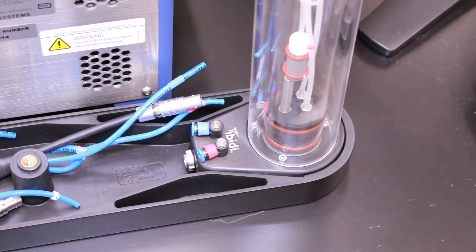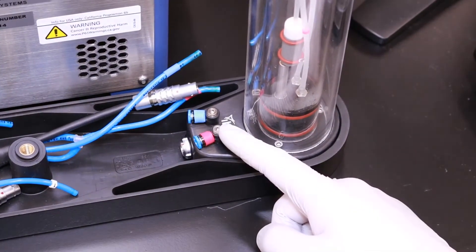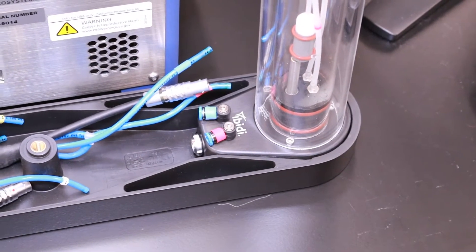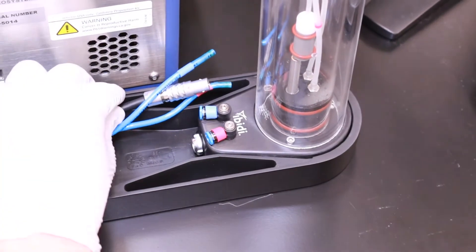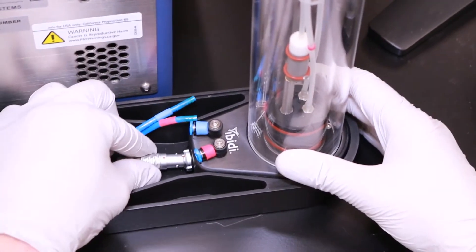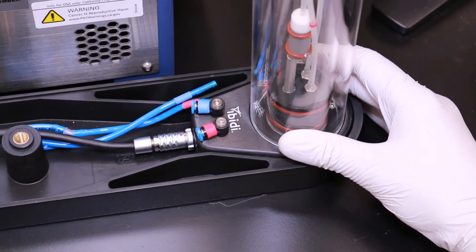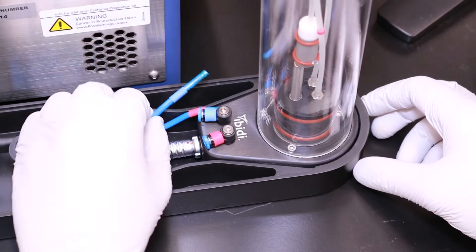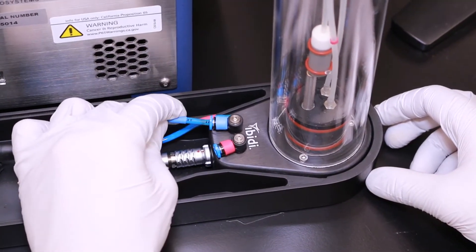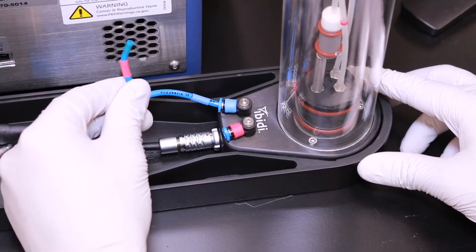Now with the environmental control tray open, we can see that the tubing as well as the ports on the humidifying column and on the side of the instrument are all color-coded to ensure the simple installation of your environmental control hardware. First, we'll take the electronics cable and align the red dot with the red dot on the port on the humidifying column, then slide the cable in. Next, we'll take the blue tubing that has a blue label on it and connect it to the appropriate port, and we'll repeat this procedure with the tubing with the red label.